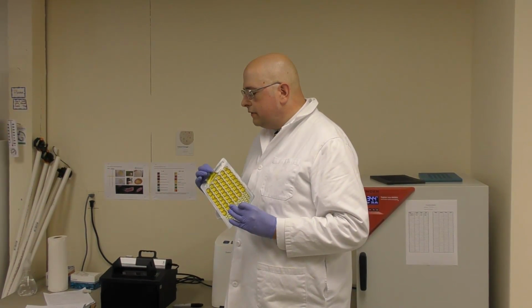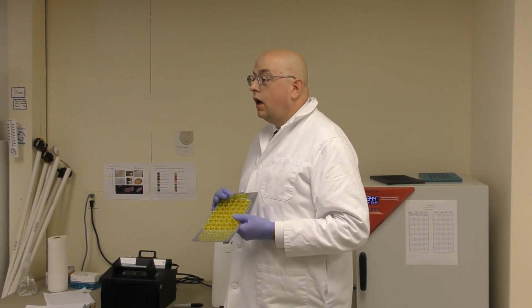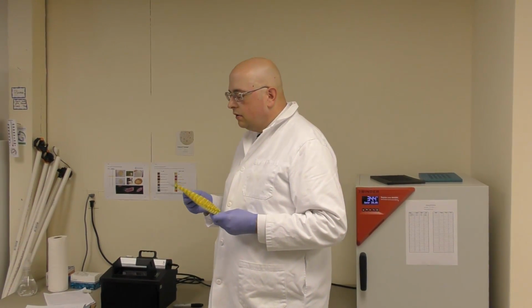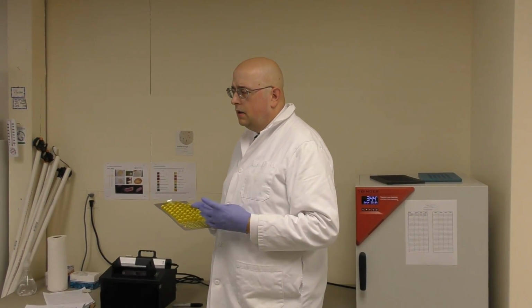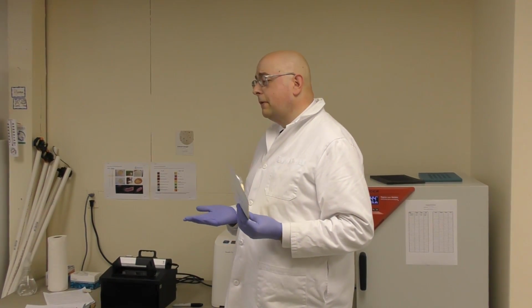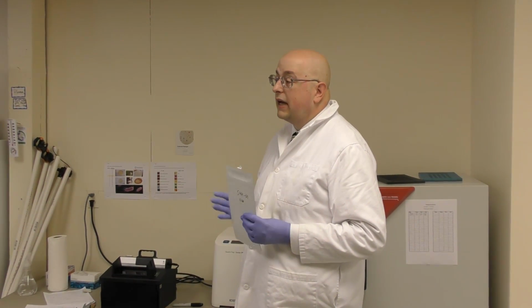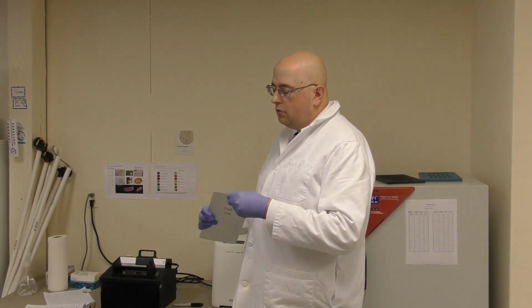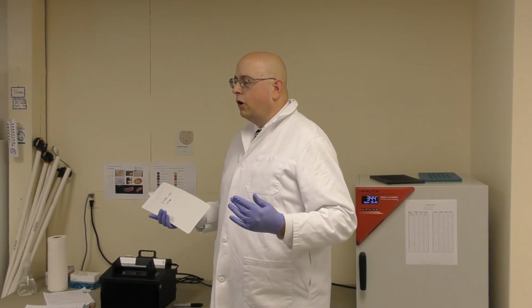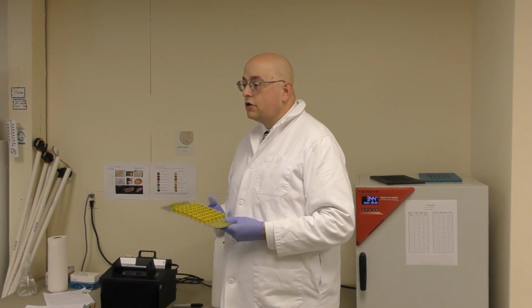If you have the equipment, some places talk about putting these in an autoclave and autoclaving it to kill the bacteria in here. However, since these are sealed, they're pretty well protected from potential contamination issues. So they could be disposed of in the trash if you don't have a mechanism to sterilize, like an autoclave. We do not recommend you try to pull these open and drain the stuff out and rinse it. No, we're more likely to cause problems than you're going to solve. So you can just dispose of these in trash.